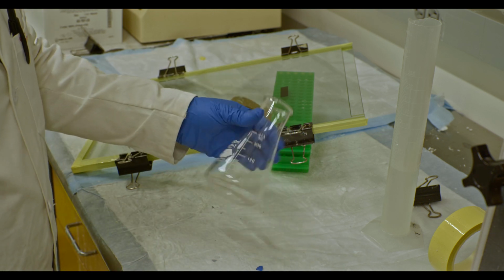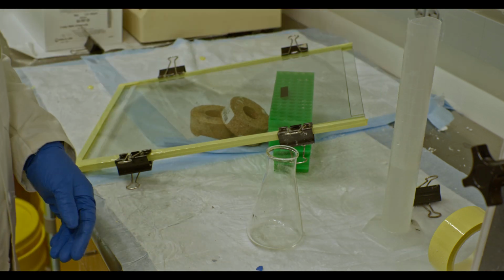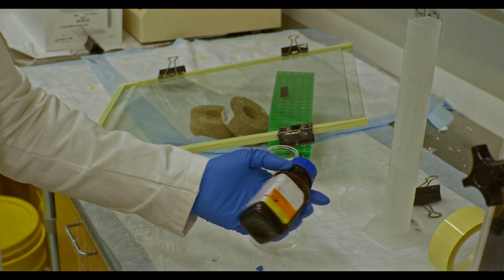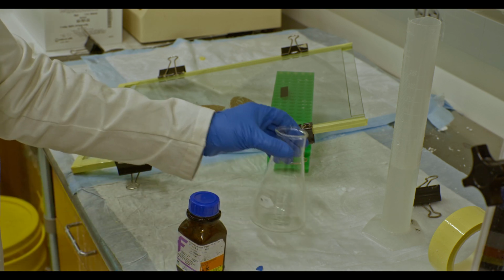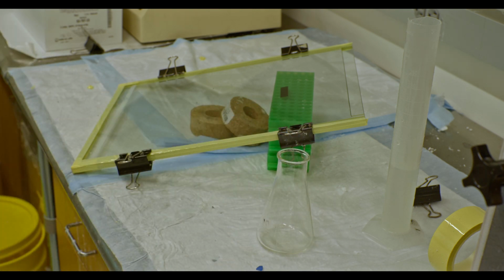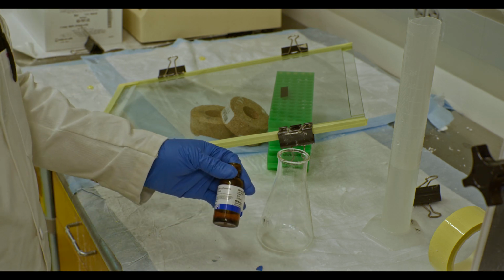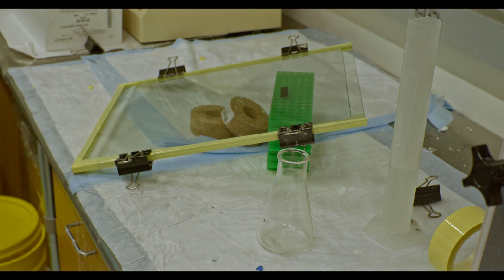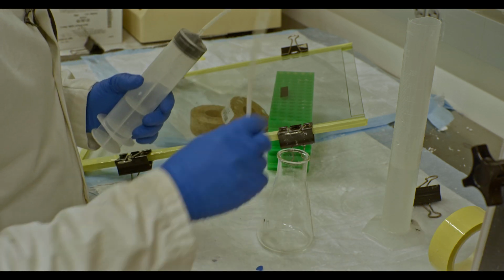For the gel solution, I like to use a 250 mL Erlenmeyer flask. I measure out at least 100 mL of 20% PAGE solution. Then that 20% PAGE solution, we're going to mix it with this salt called ammonium persulfate. It will dissolve eventually over time. You'll just have to shake your flask by hand. It should dissolve quite readily. And then finally, whenever you're ready to lay down the gel, the next important piece is this TEMED. This TEMED is one of the radical initiators, so it will start the polymerization process. It'll be pretty quick, so you'll want to move quickly, but not all over the place.